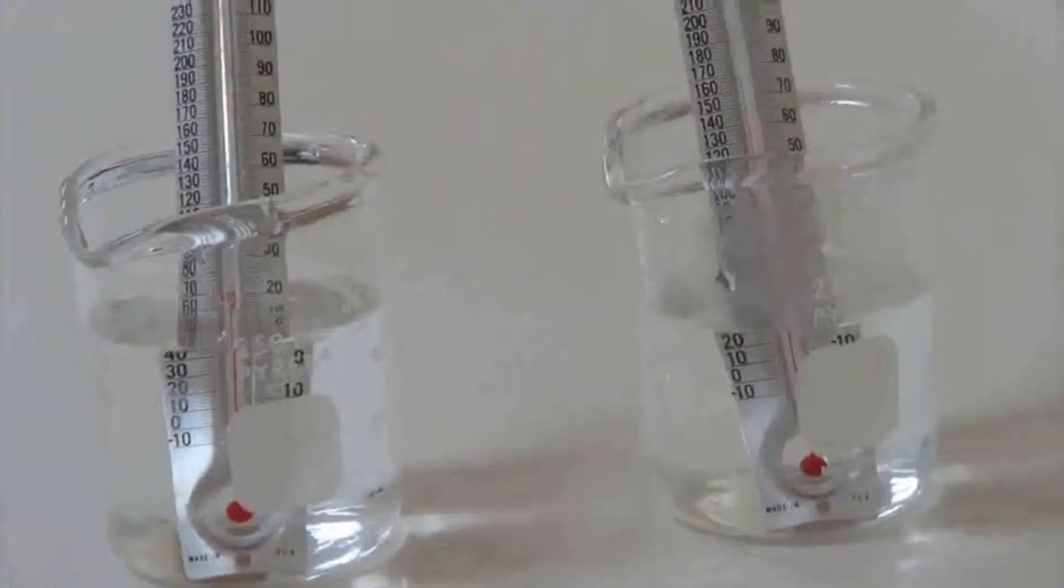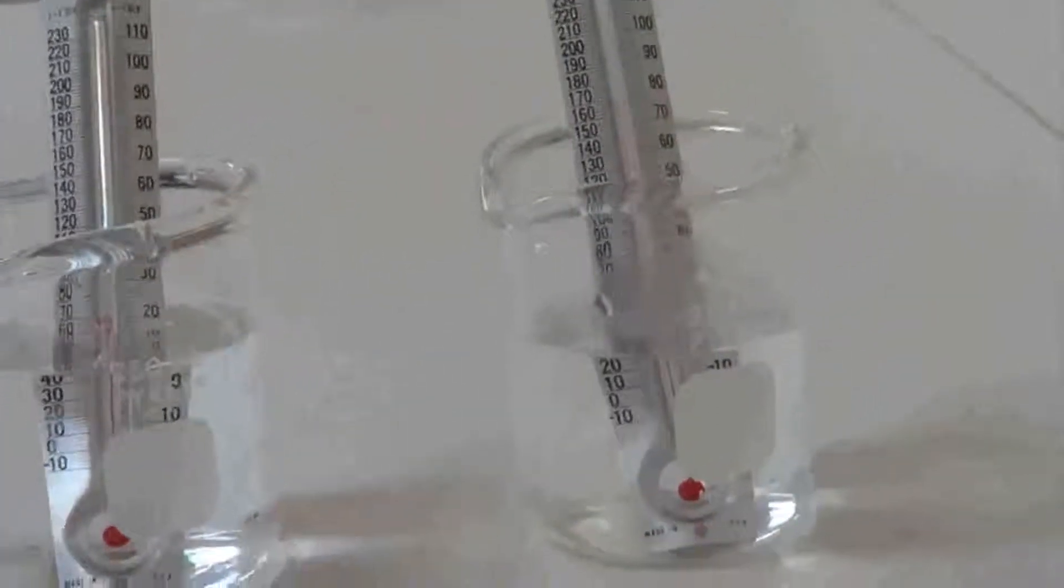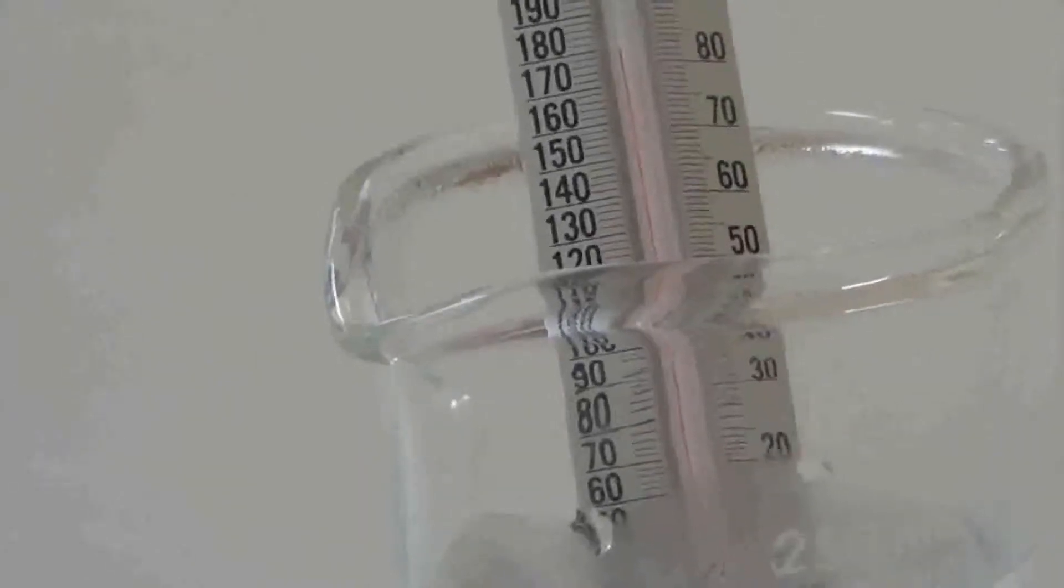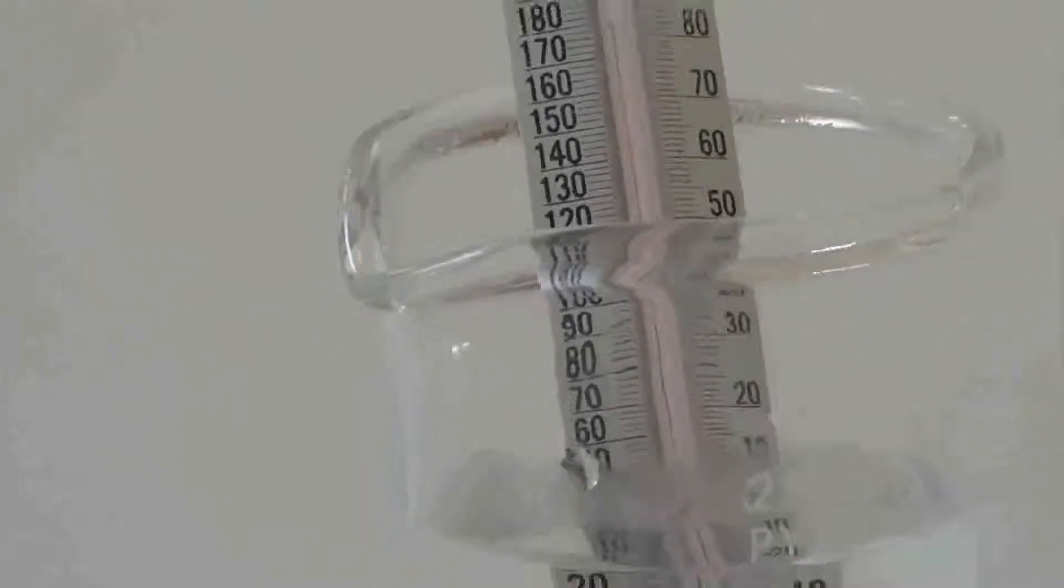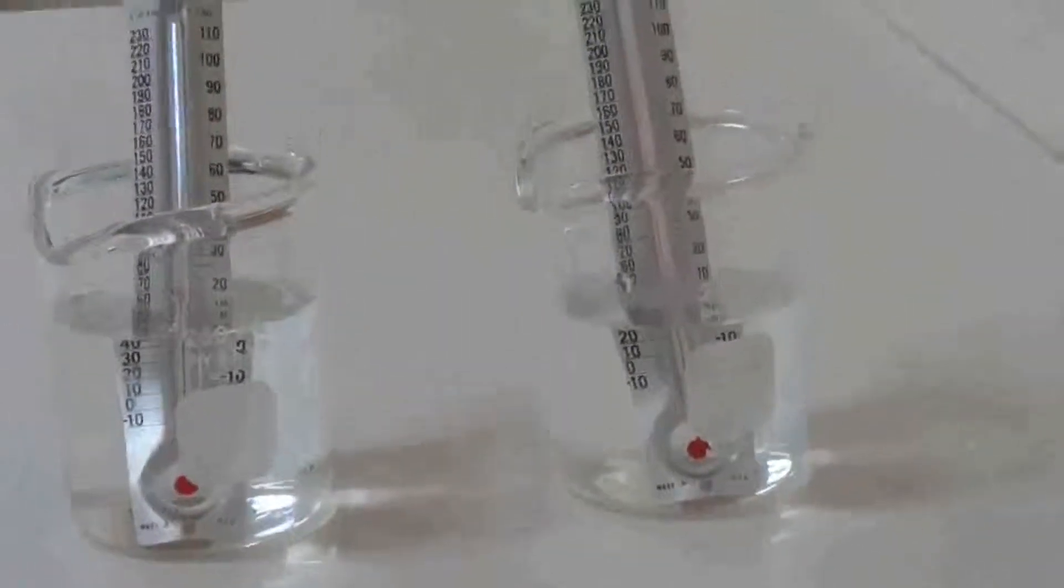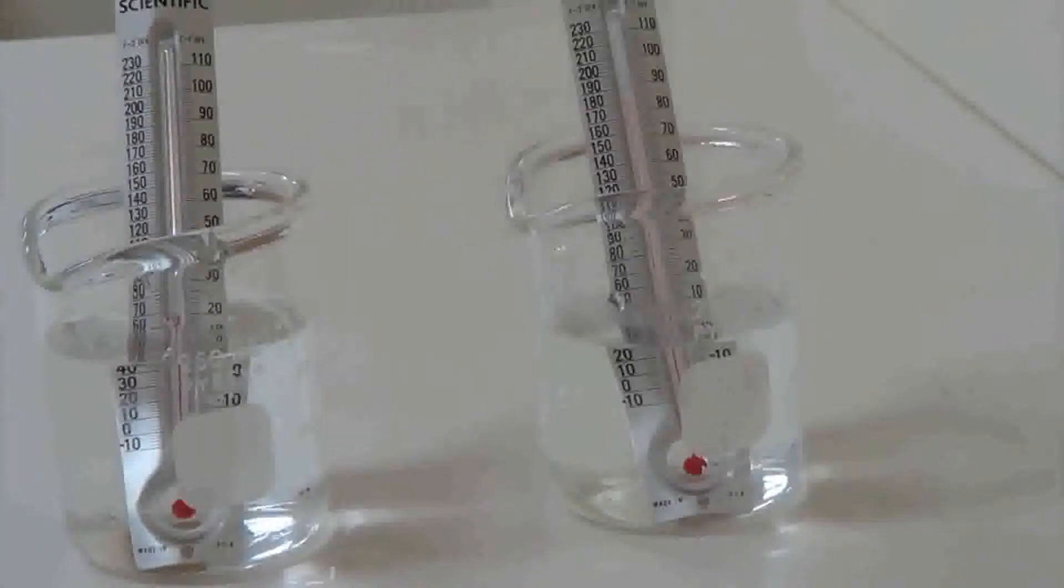Notice the one over to the right. If I zoom in on this thermometer, you can see that this is very warm. If we were to grab that piece of glassware, it would not be good news for us. That is sitting at just over 180 degrees. Now that the thermometer is in there, you might actually still be able to see steam coming off the top. The whole point of this is when you heat glassware, be extremely careful. Even if it doesn't look hot, assume that it is.